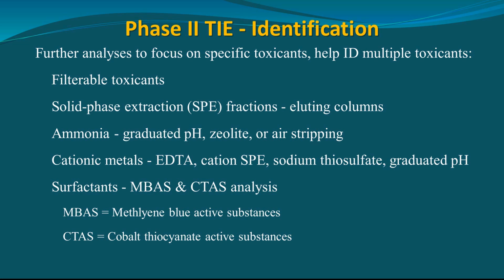We have no experience in our laboratory with surfactants, but in certain cases, there are industrial discharges that have soaps associated with them. So these steps are part of that process. Same thing with certain manufacturing that have dyes associated with them. So there are TIE steps for those types of constituents.